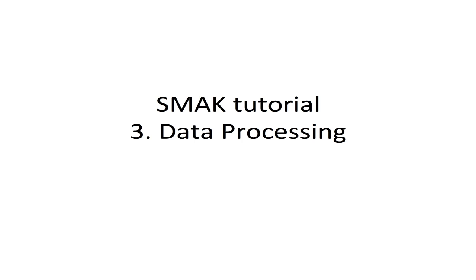That's all for this tutorial. Please join us for the next tutorial, Data Processing, where we can begin to apply these tools that you've learned in SMAK.